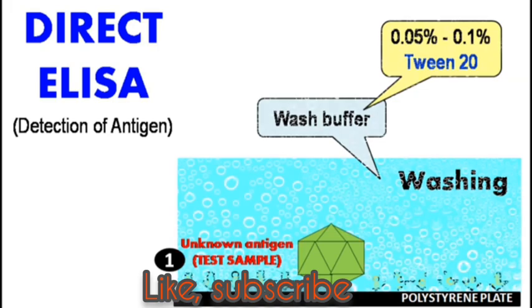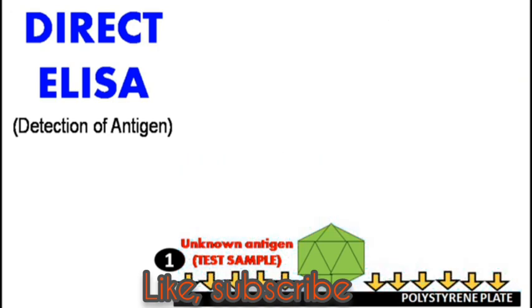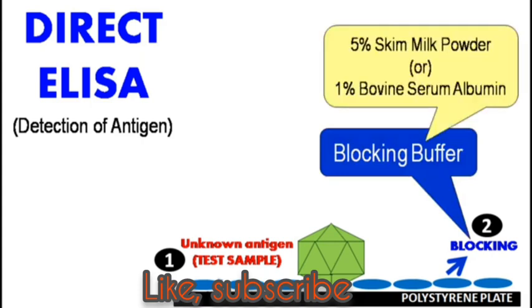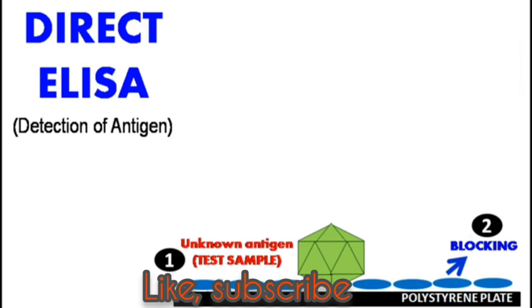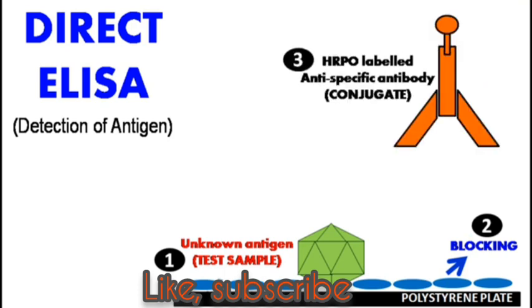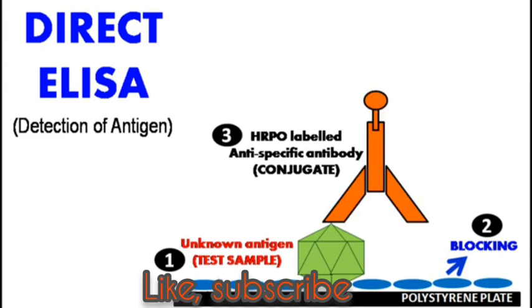After washing, there are unoccupied spaces left that may interfere through nonspecific binding of any antigen or antibodies. So the second step is blocking. Here these unoccupied spaces are blocked by using blocking buffer, made up of 5% skim milk powder or 1% bovine serum albumin. After blocking, incubation and washing, a known HRPO-labeled anti-specific antibody is added to bind to this specific antigen.